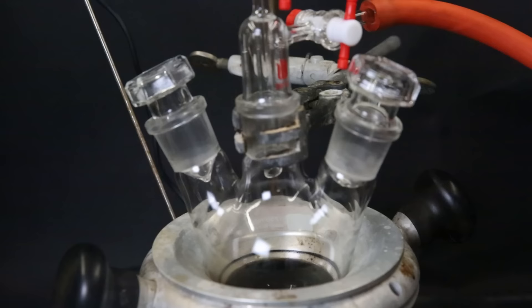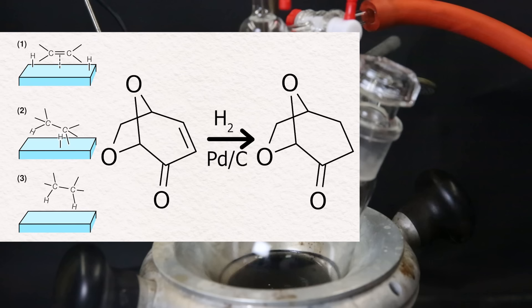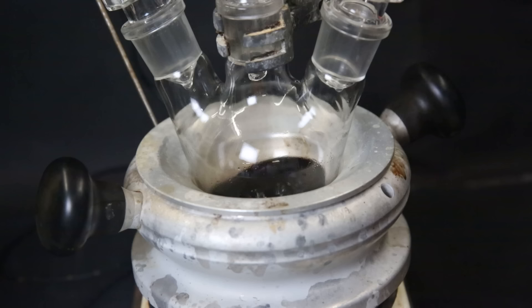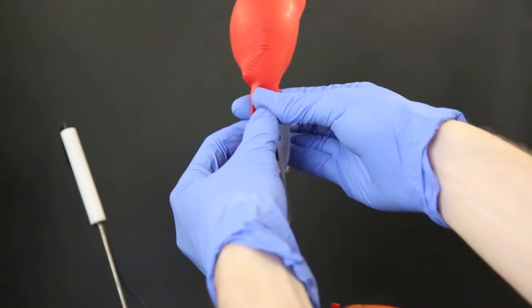In short, during this reaction the palladium particles that are loaded onto the carbon will adsorb hydrogen onto its surface. Levoglucosanone has a double bond that is susceptible to hydrogenation since it can also attach to the surface of the palladium and pick up a nearby adsorbed hydrogen. Which will turn its double bond into a single bond. I leave it running at 30°C for about one day and when I come back it looks pretty much the same. And the balloon has almost completely deflated.